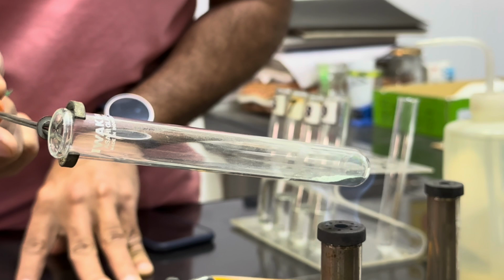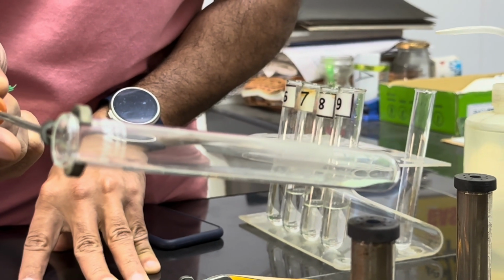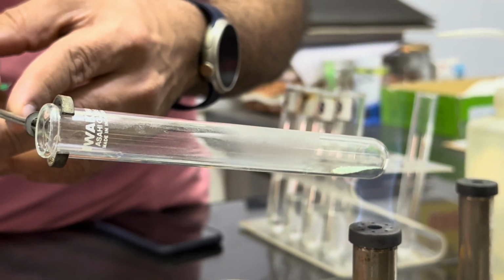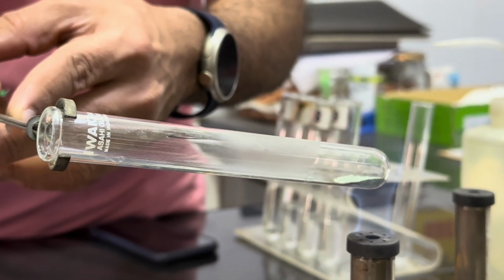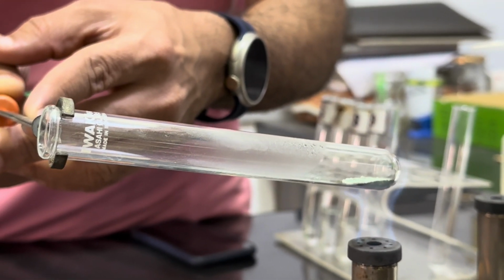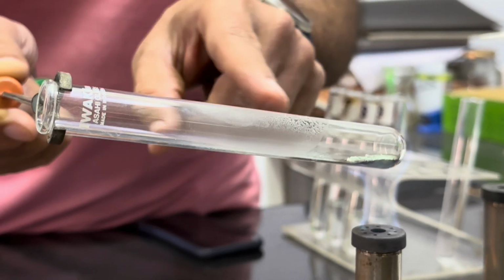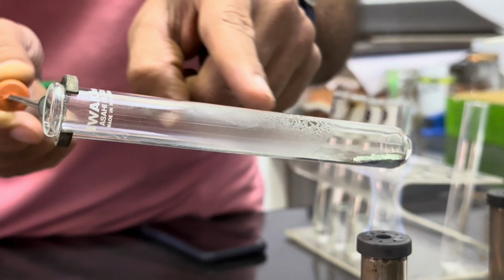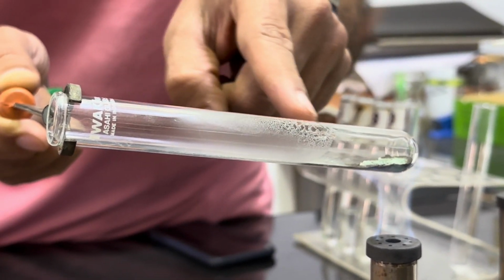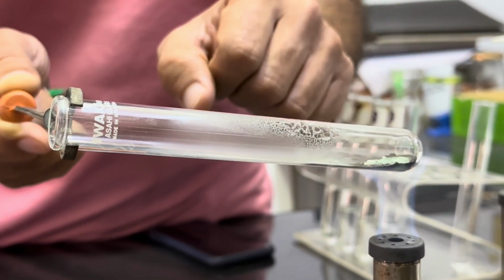Strong heating means we will put this on the flame and the flame will cover from all the corners of the tube. This is what we call strong heating. And now in this heating, the first observation I am getting here is the water vapors are condensing on the neck of the tube. Here are the water vapors, we can see clearly.